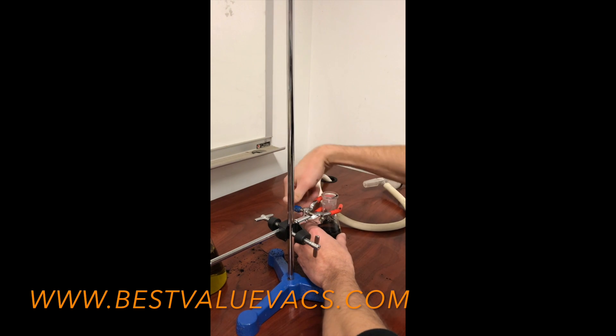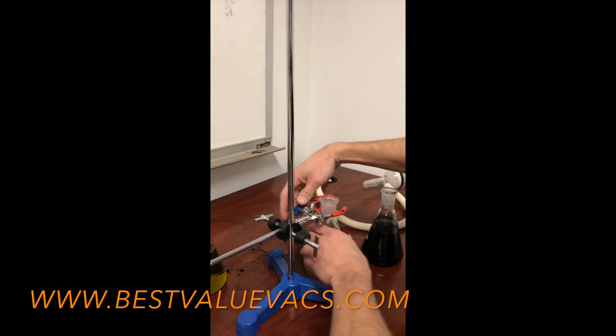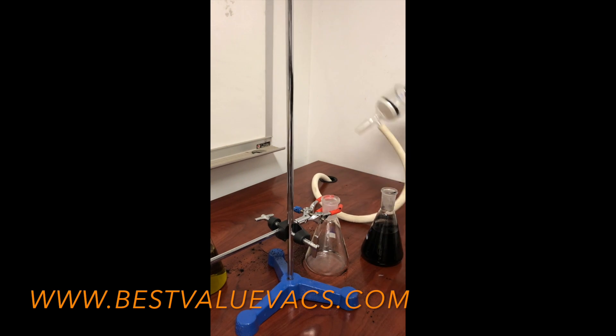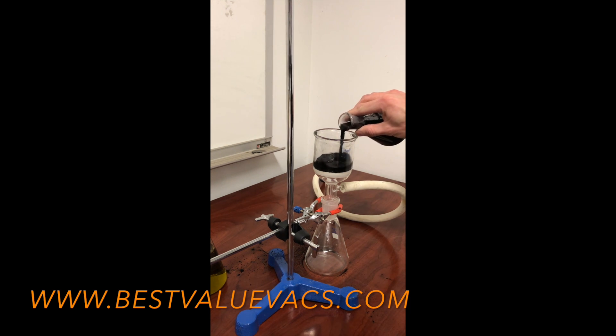We're going to switch out the flasks and get a fresh one going, then put the filter back on it with the vacuum pump running. This material runs a little bit finer so it's going to take a little more time — I'll probably have to run the vacuum pump for about three to five minutes or so.